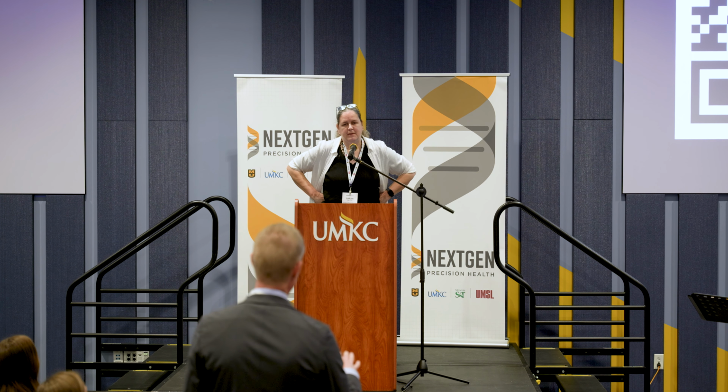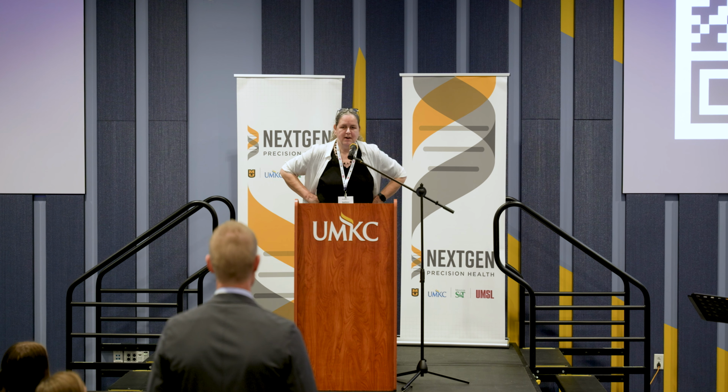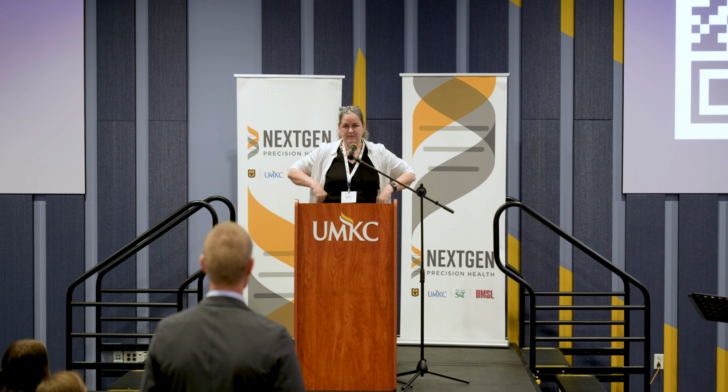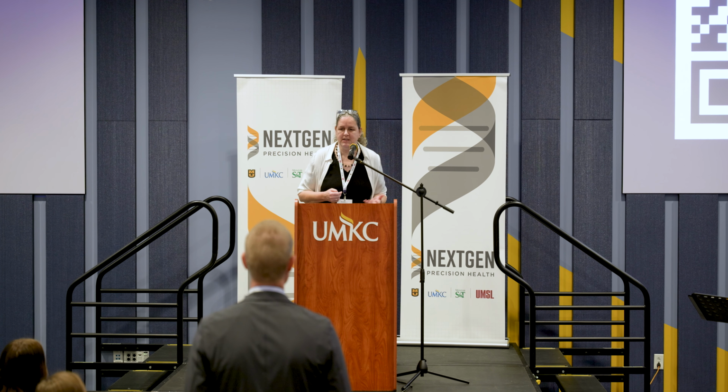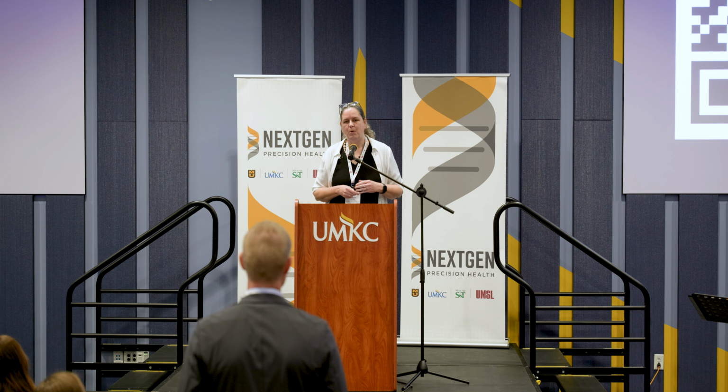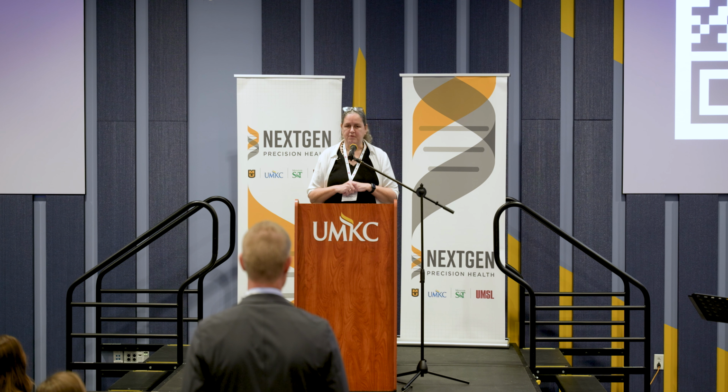And if you have, at what age do you see that? So we haven't, but we are doing work with age. It takes like 2 years to age up the mice to get them to what we would consider geriatric animals. So we haven't had a chance to do this imaging yet on the aged mice, but we are anticipating that some of those dynamics would be very different.